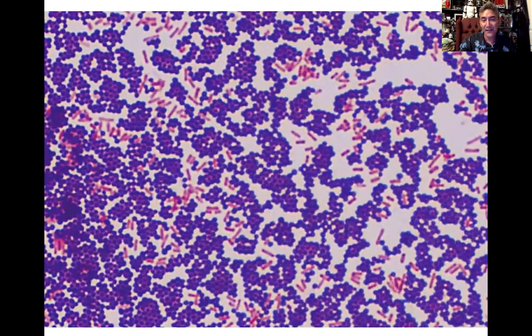But we can see now gram-positive, little clusters of circles. So we would call this staphylococcus, gram-positive staphylococcus, and then gram-negative bacilli. So it's just individually scattered. So we're looking at 2 different types of bacteria in this situation. So this is how this information would be used.